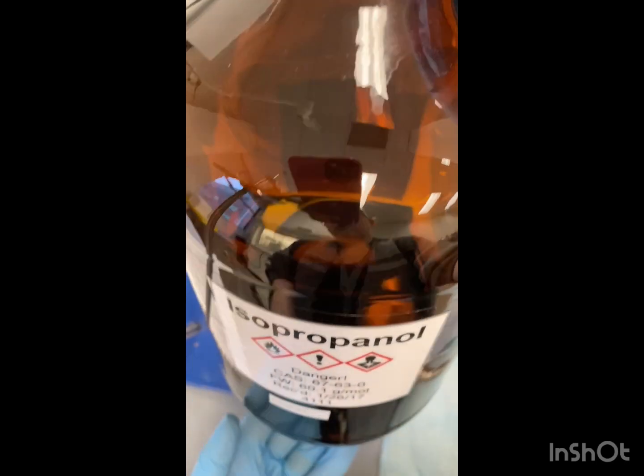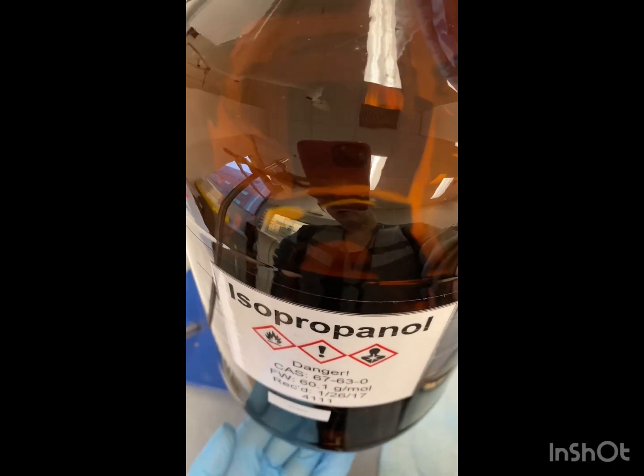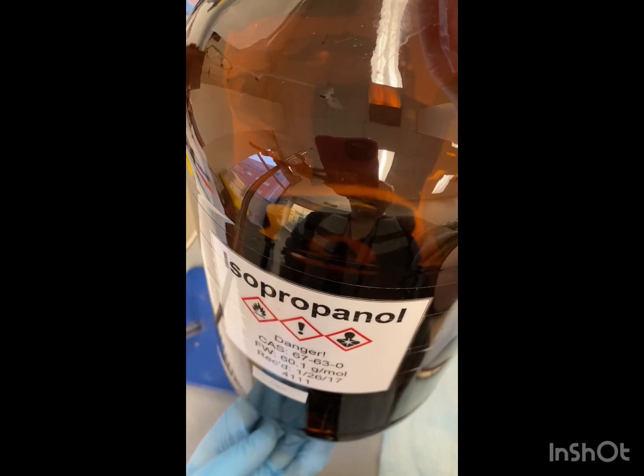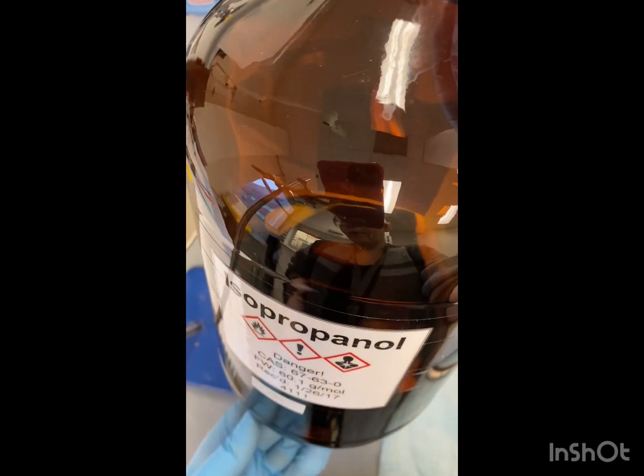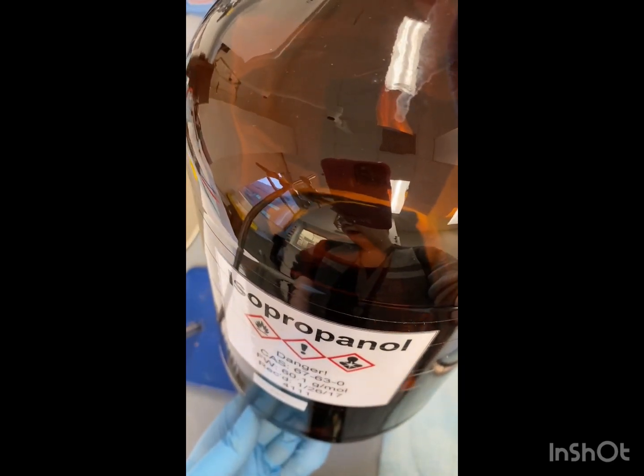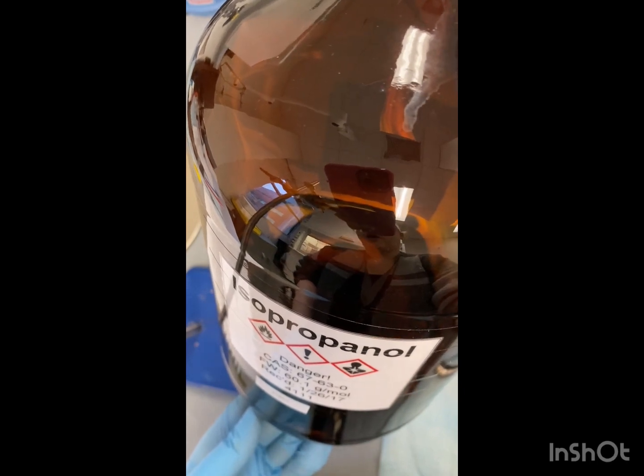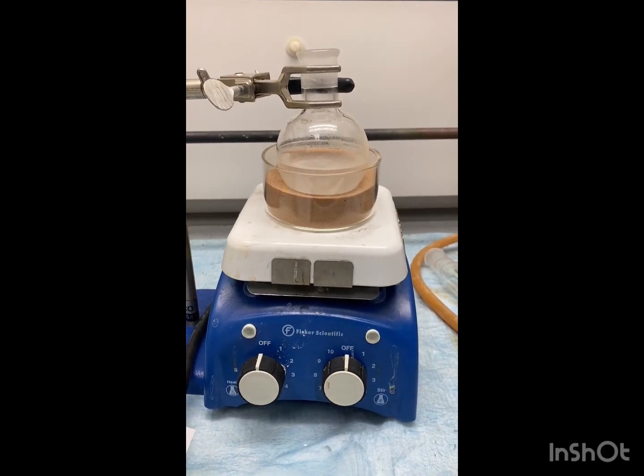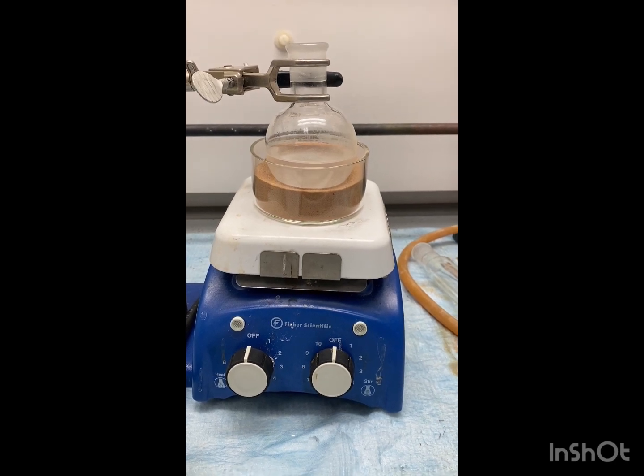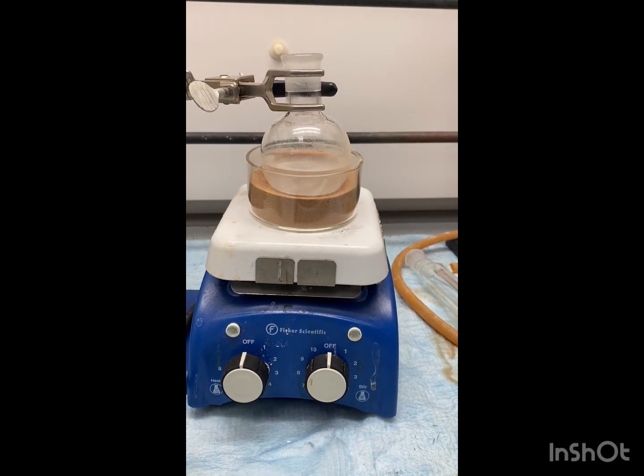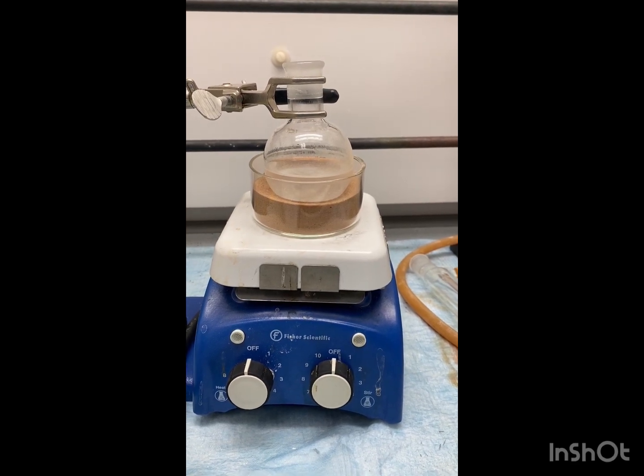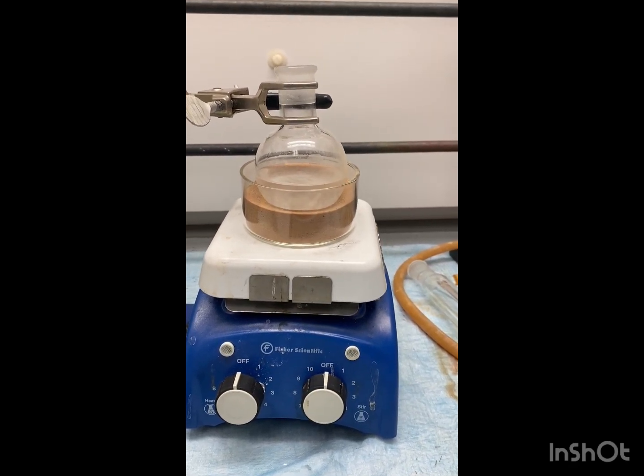So we've added our phenylsuccinic acid and our L-proline to our round bottom flask. Next, we're going to add 40 mils of isopropanol to the round bottom flask, and then we're going to add a stir bar and set up a reflux. So we have our phenylsuccinic acid, our L-proline, and our isopropanol and a stir bar in our 100 milliliter round bottom flask.